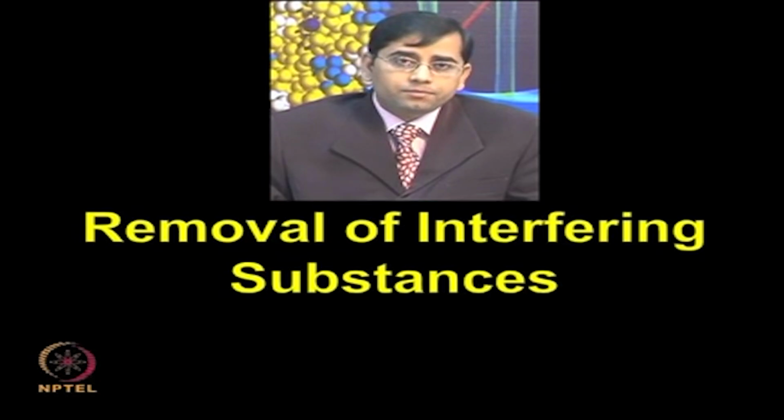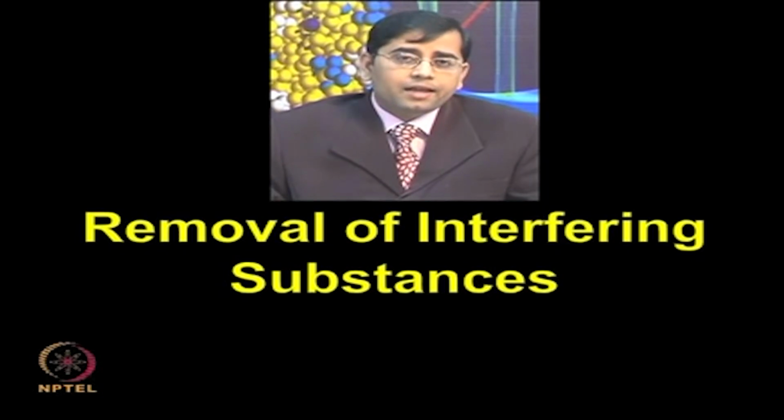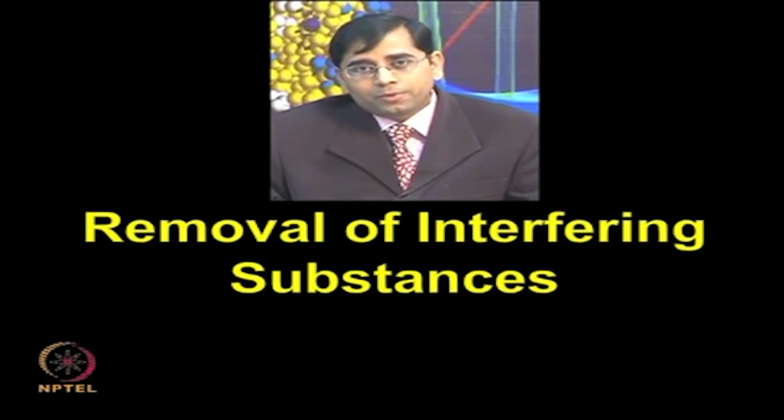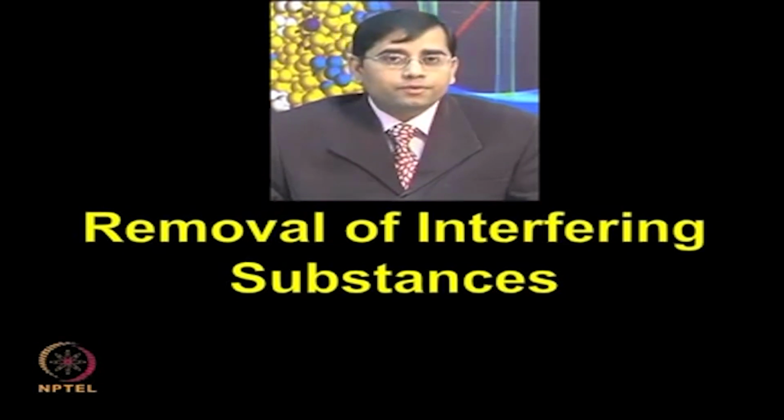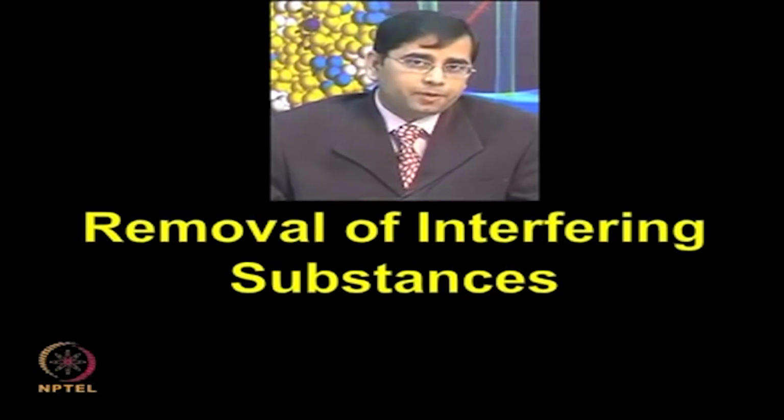In all of these methods, different types of interfering substances will be very detrimental. So, let us talk about what these interfering substances are and how we can get rid of them. It is probably not possible to completely remove these interfering substances, but at least partially. If we can remove them, that will ensure the success of your further experiment.